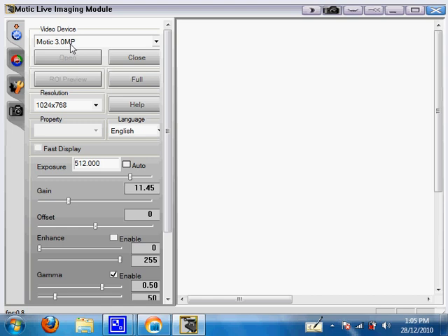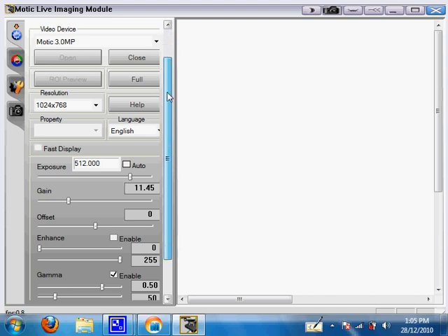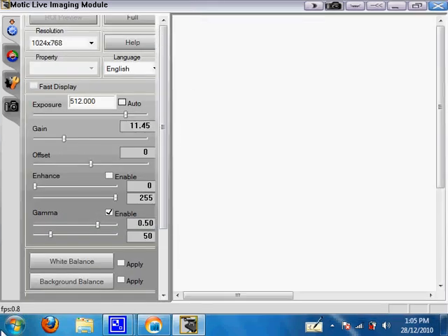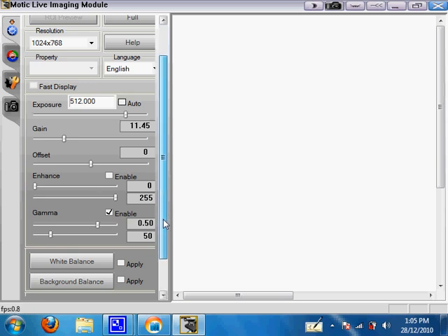What's important is it does say something in this box. That's how you know for sure that your software is talking to your camera. Also, another thing to note is your FPS or your frames per second is higher than 0.0. That's another clear sign that your software is talking to your camera.